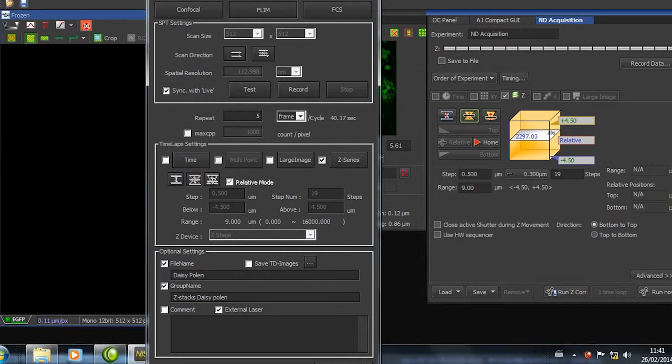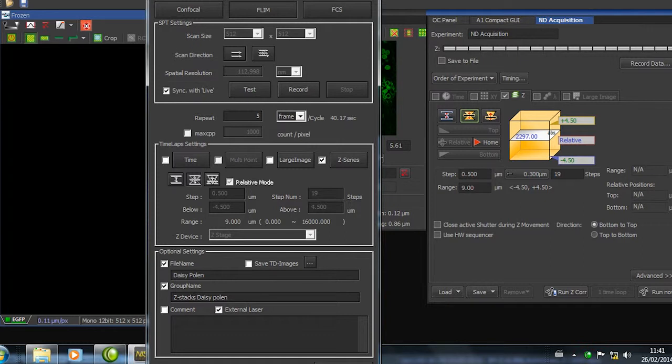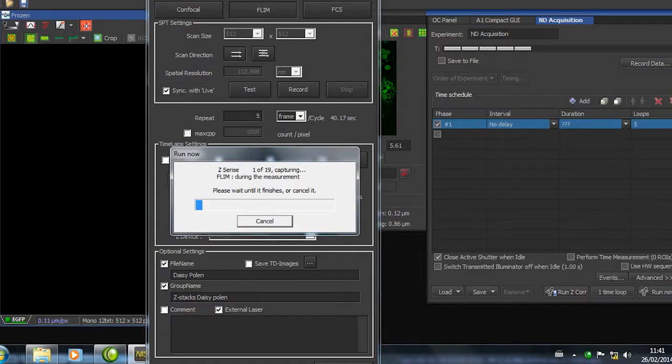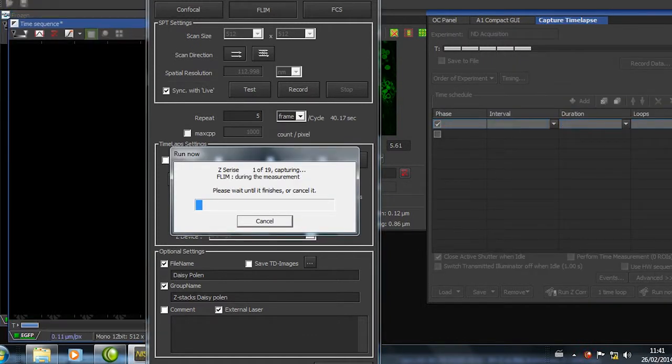And for this, we've got a button here that unfortunately, due to the resolution of the screen for the video, it's not fitting within the screen, but if I just activate it, it starts to run.